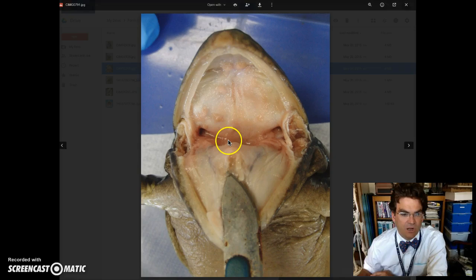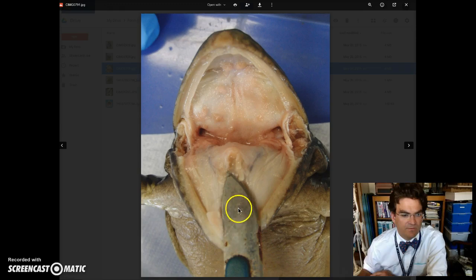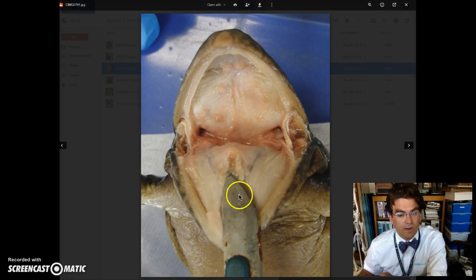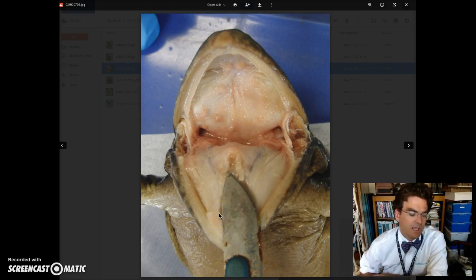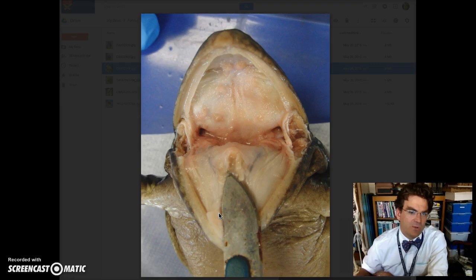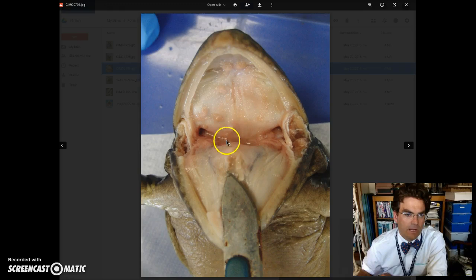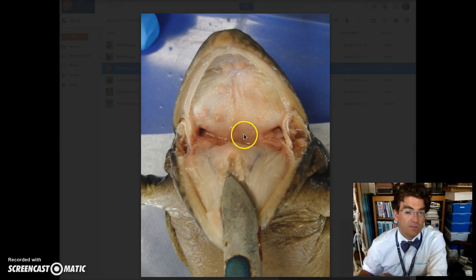The first thing is the tongue, and the tongue is actually covered up here by this scalpel, but the tongue of the frog is located right here at the front of the mouth so that it can flip out, and so you want to label this area right here as the spot for the tongue. Most of you would cut out the tongue during your dissections. The next thing is the esophagus, and the esophagus is this larger hole right here. That's where the food goes down, and that leads to the stomach of the frog.